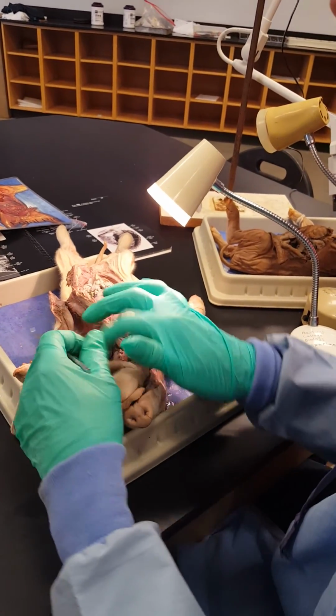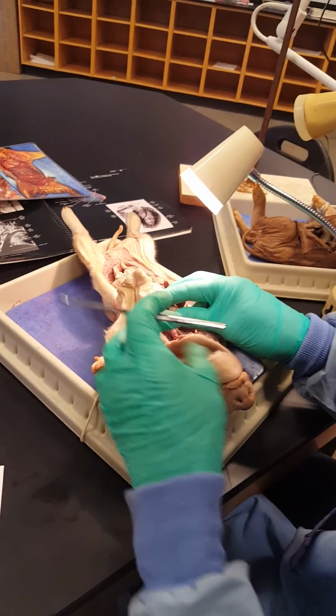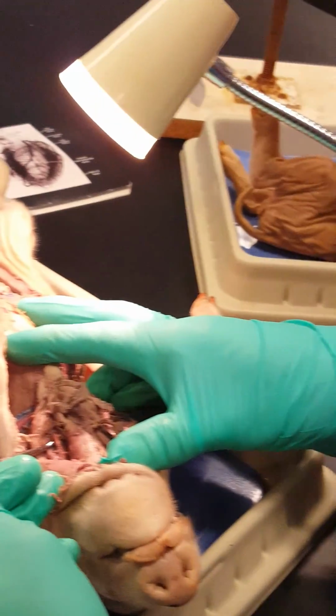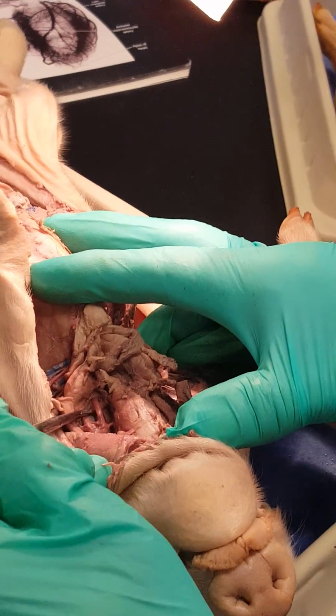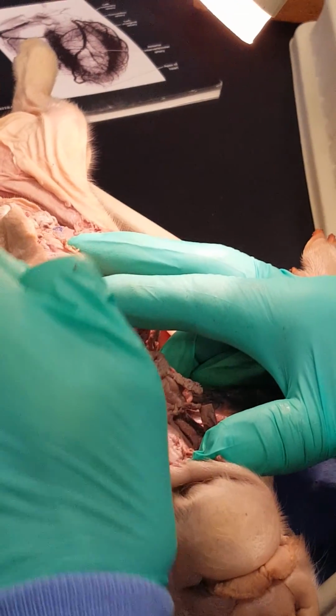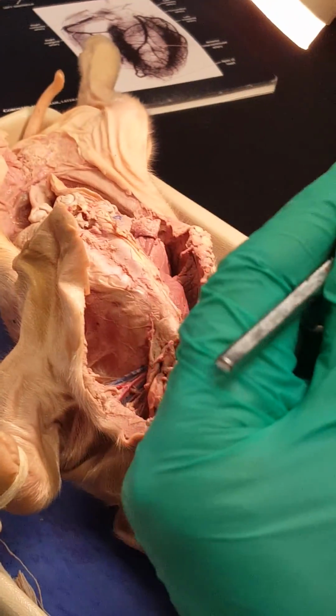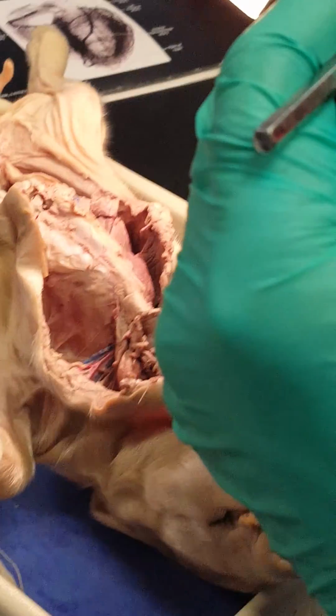Okay? On the left side, we dig here beside the trachea, we can see the left common carotid, which again will run up here and fork into internal and external carotids. And that will be the second great vessel off the aortic arch.